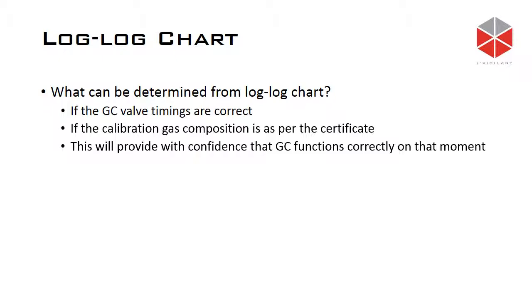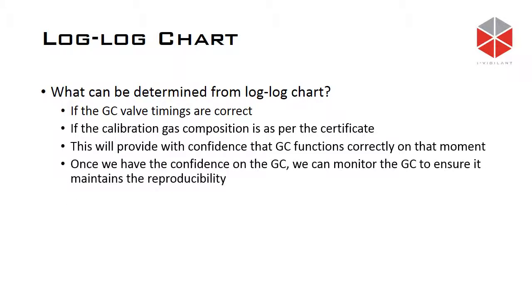Now, we know that the GC works fine. What do we do next? So once we have the confidence in the GC, we basically monitor the calibration result throughout the time to see whether the GC maintains its reproducibility.